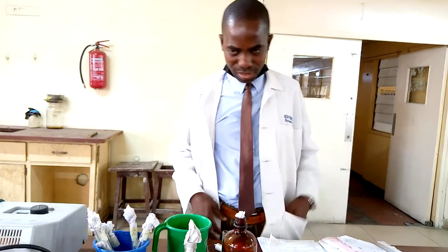In your manual, you see ethanol, 80% ethanol in water, but you can also use 10% TCA, 0.33 molar HCl, sodium tungstate, or ammonium sulfate to precipitate your protein. When you have centrifuged it, you'll be left with your protein sample, and then you can analyze or even estimate the amount of protein present.